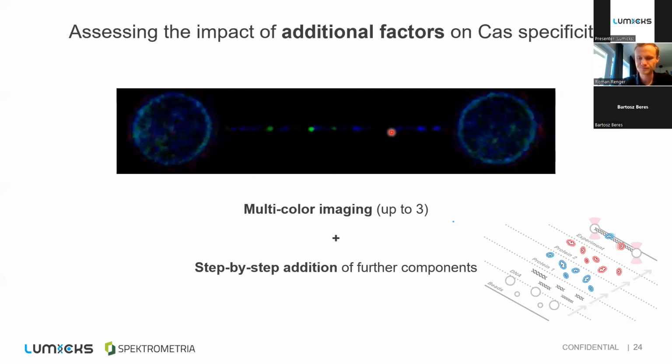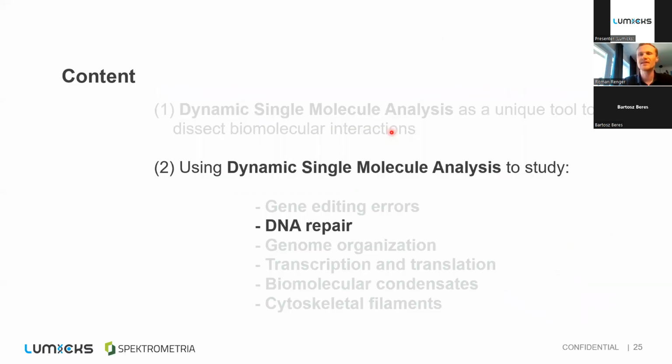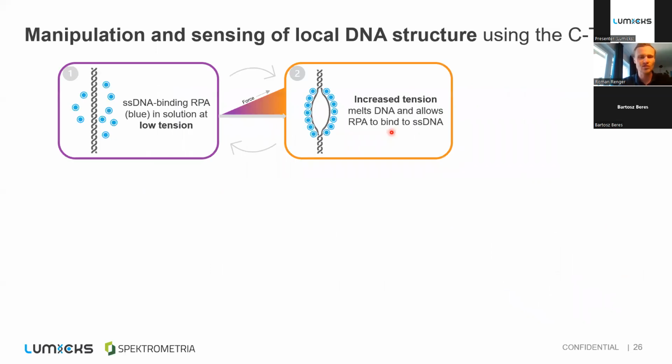The second application I would like to talk about is DNA repair. Of course, many of you might be studying proteins that are involved in DNA repair, and it would be really nice to observe how these DNA repair proteins actually act on the single DNA molecule level. An example that has been performed in an actual publication, I think it was published in Cell 2020, was the following.